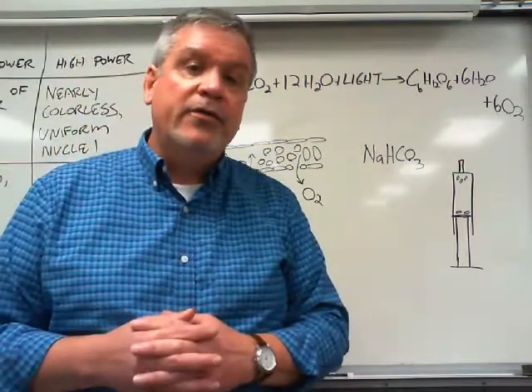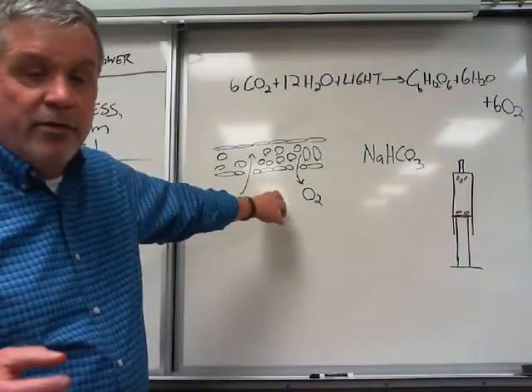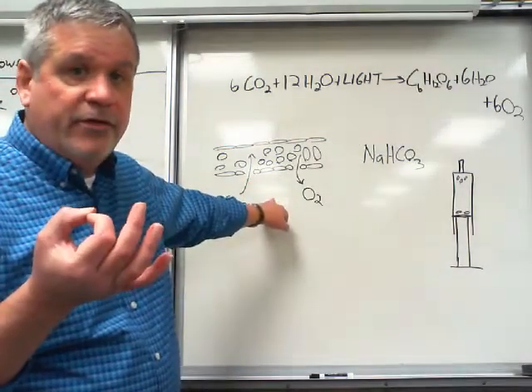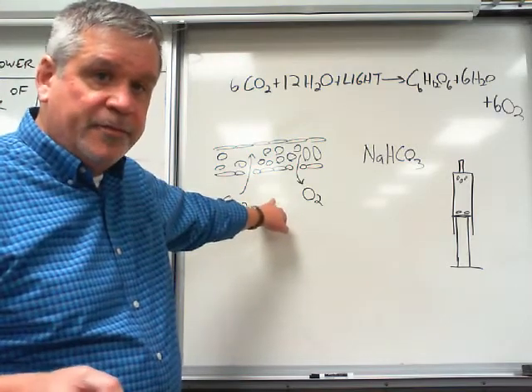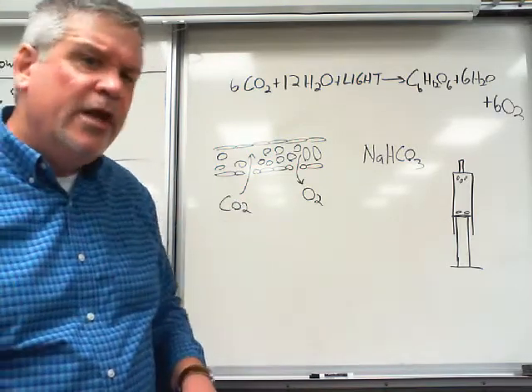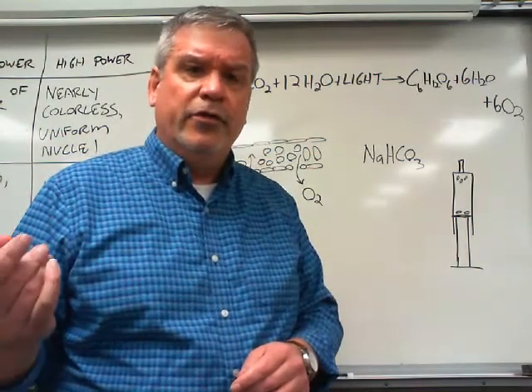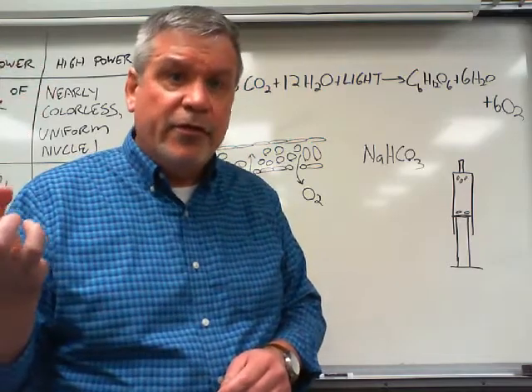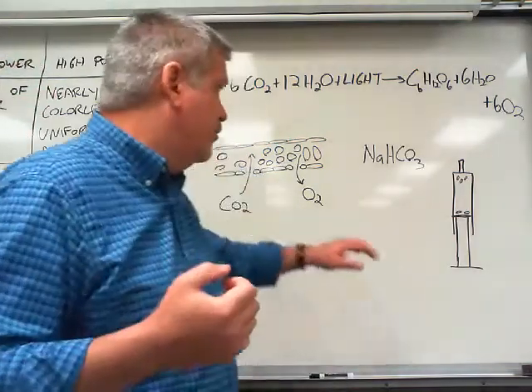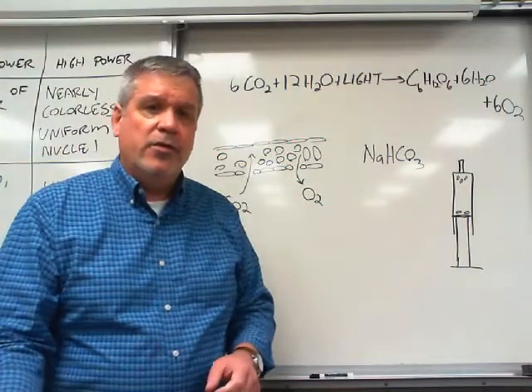Now in this floating leaf disc assay, we're going to evacuate the air out of the leaf discs so that they no longer float, but rather they sink. Okay, so we do that by putting just a little bit of dish soap inside of a solution of water. This breaks the surface tension so that water can get into the small spaces inside of the leaf, and then the leaf disc is going to sink.